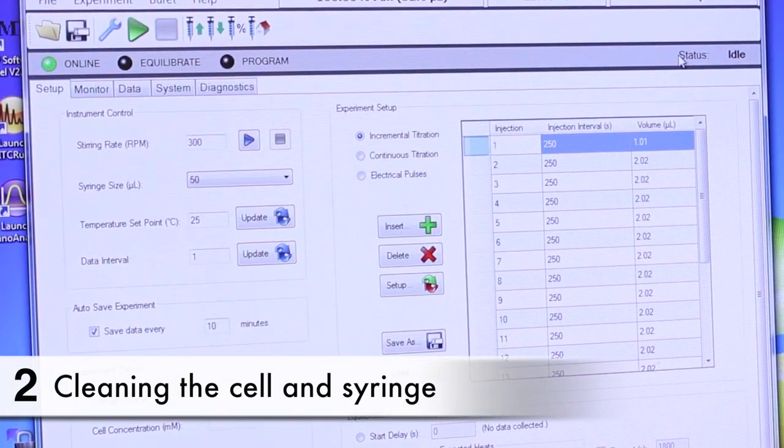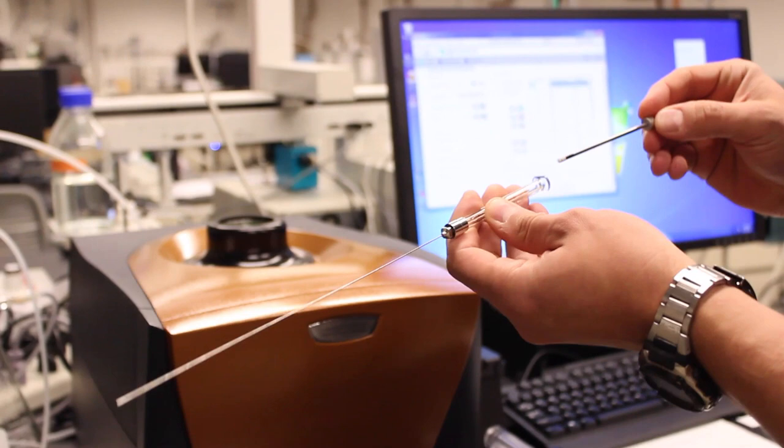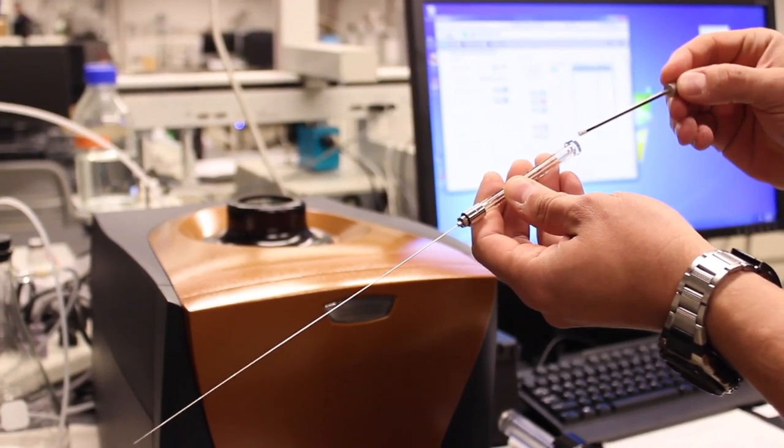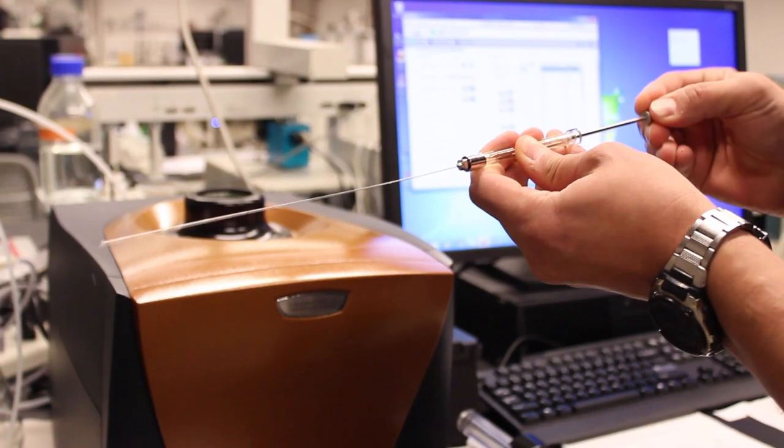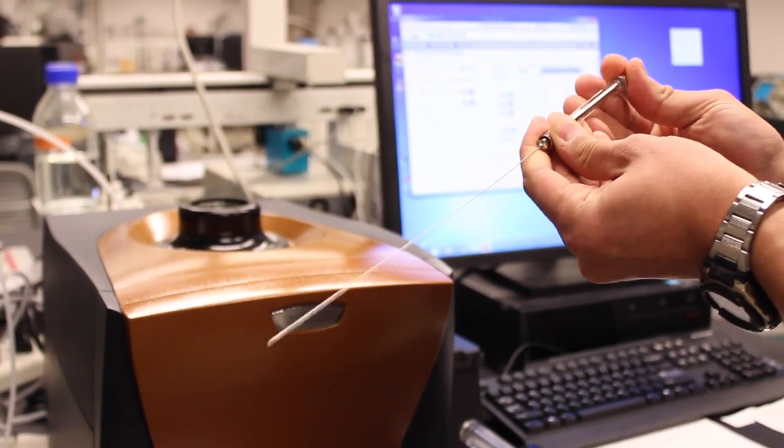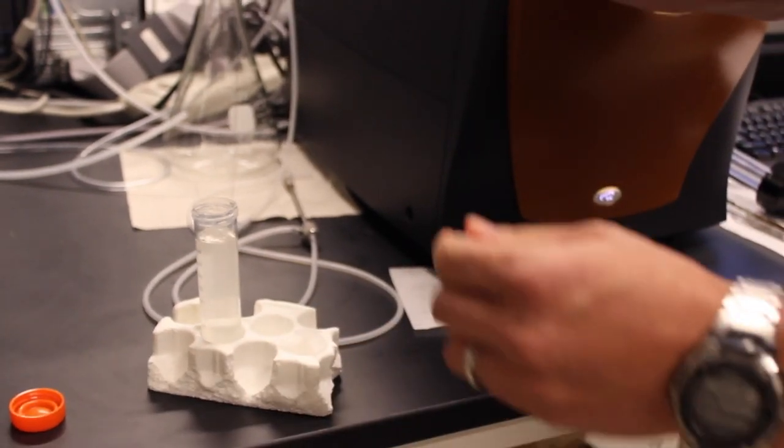To clean the cell, we're going to go back and remove the burette again. There's a number of ways that you can clean the cell. If the cell is already relatively clean, you can use a half mil syringe like this with a long needle and you can suck up some solution.